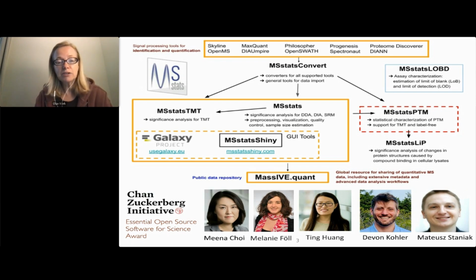And then the output of MSstats is compatible with MassIVE-quant. So this is an extension to the MassIVE repository where you can store the results of your quantitative analysis and also all the analysis intermediate steps and scripts and parameter files, etc., to make sure that your entire quantitative analysis workflow is reproducible.